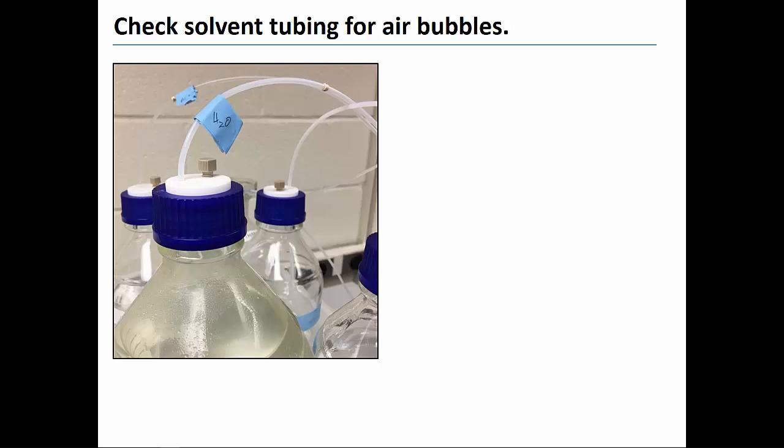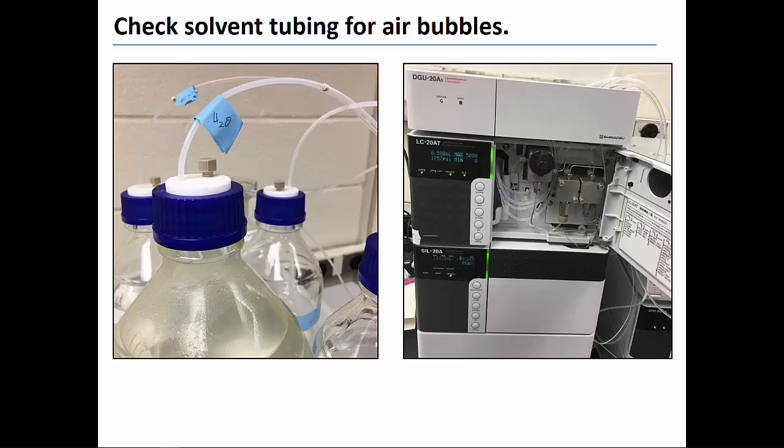Prior to starting an analysis, be sure to check the lines from the solvent bottles for air bubbles. If air bubbles are allowed to reach the column, column performance can deteriorate. If you see any bubbles in the lines between the solvent bottles and the pump, open the pump purge valve by rotating counterclockwise one half turn. After you open the purge valve a half turn, solvent will flow from the pump directly to the waste container without passing through the column or any detectors. Keep the purge valve open until all air bubbles pass through the pump. This may take several minutes.